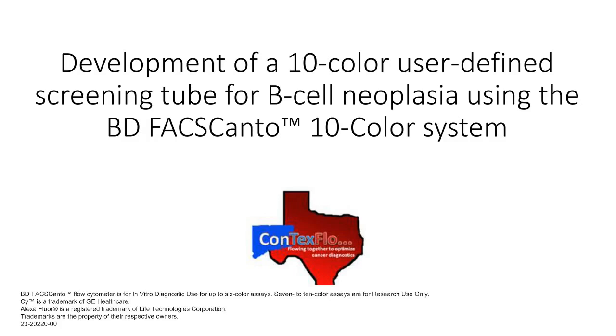One of the things that we do is, we're triaging our cases up front. So in situations where you may see a lot of background type staining for surface immunoglobulin, we will go ahead and pre-incubate at 37 degrees. If the patient has HIV or some type of rheumatologic disorder, we do that in cases that are follow-up cases where the lymphomas were negative for surface immunoglobulin. So we'll pre-incubate in those situations as well.